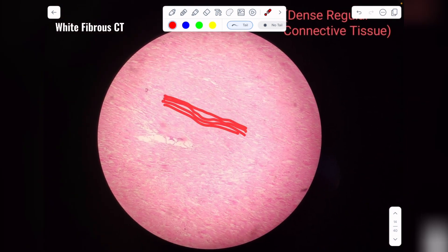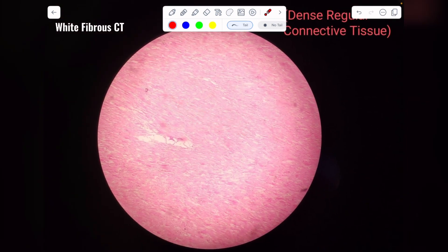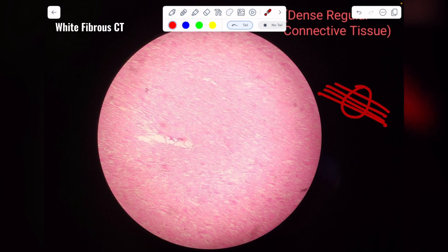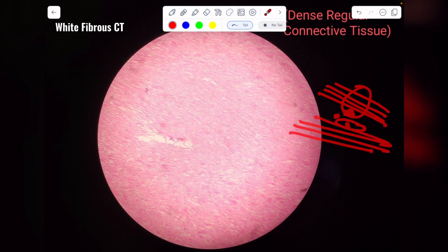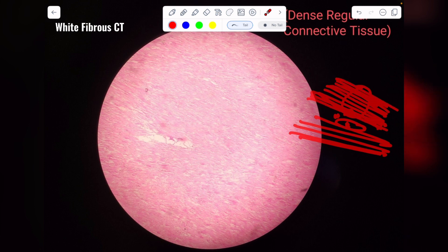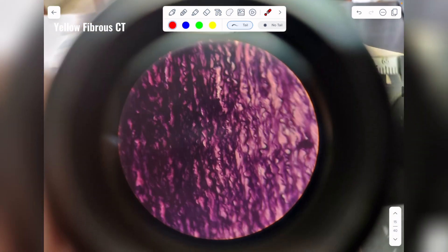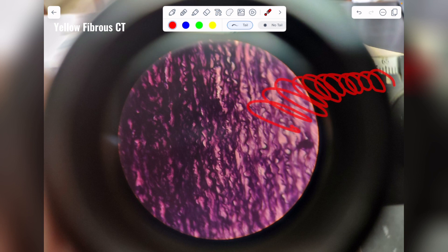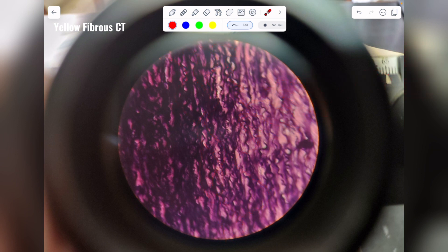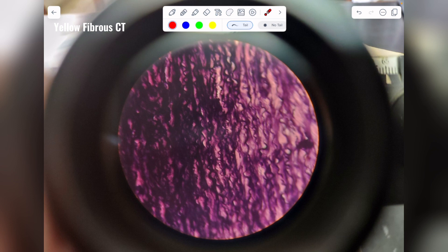One last time — this is your white fibrous connective tissue: it contains white fibers arranged in bundles, and in between these bundles you can find the nuclei of fibroblasts sandwiched between the densely arranged white fibers. Now looking at elastin fibers — these are present in the form of highly wriggly pasta-noodle-like structures, densely and regularly arranged. This is your yellow fibrous or elastin fiber dense regular connective tissue.